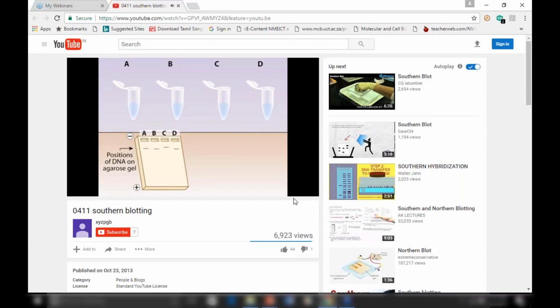Although the plasmids in A, B, and D appear to be the same, we must perform other tests before we can come to this conclusion. Our next step is to add enzymes called restriction enzymes to the plasmids. An example of a restriction enzyme is EcoR1. A restriction enzyme cuts the DNA at a particular recognition sequence. EcoR1 recognizes and cuts the sequence GAATTC.